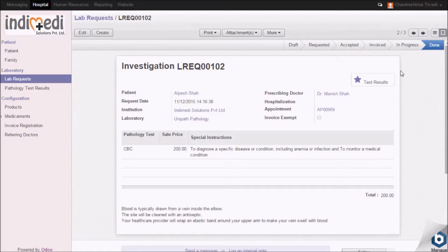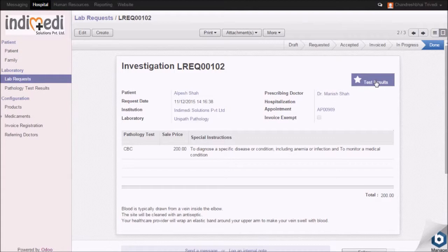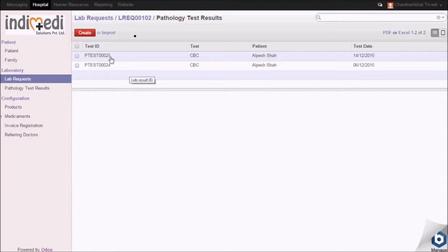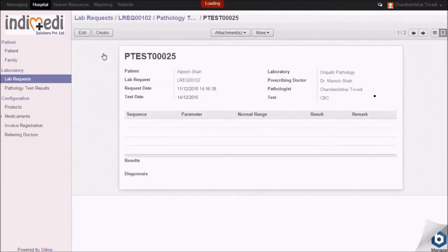For test results, click on test result. Click on the test ID at lab request page, click on edit.